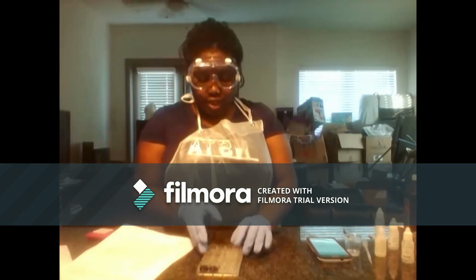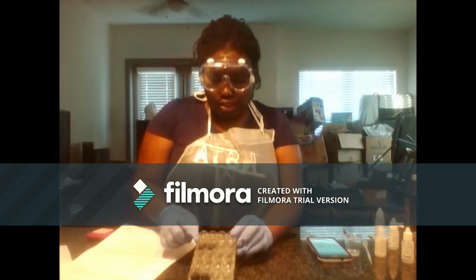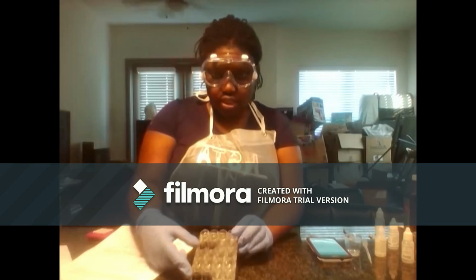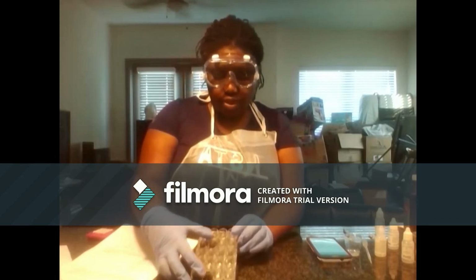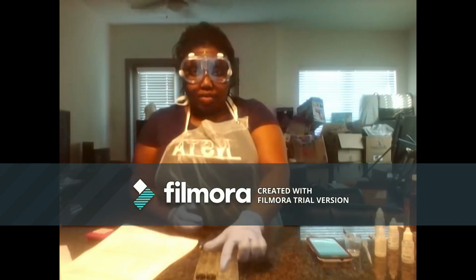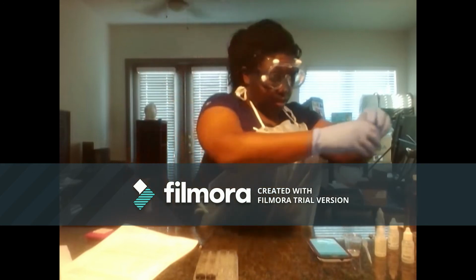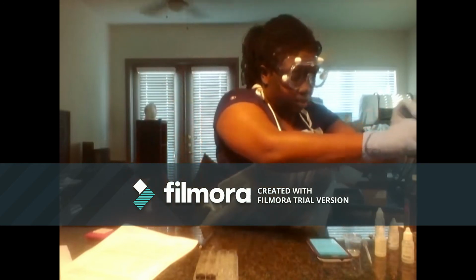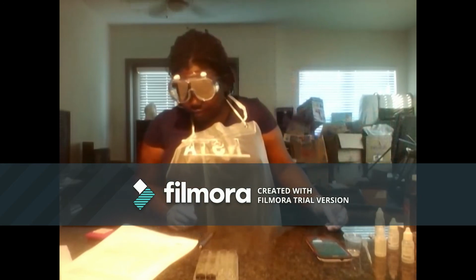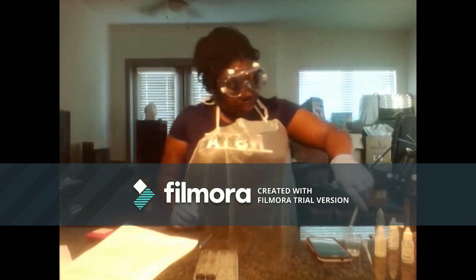Alright, so I've done my trial 1s. I had to have 2 separate times. Then I've done my trial 2s. Those are my 2 separate times. And now I'll be starting on my trials 3 and 4 with their respective concentrations of solution. Now I'm going to add in 0.3 mLs of hydrogen peroxide.